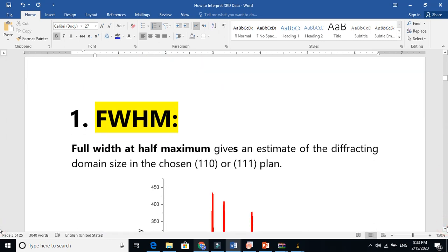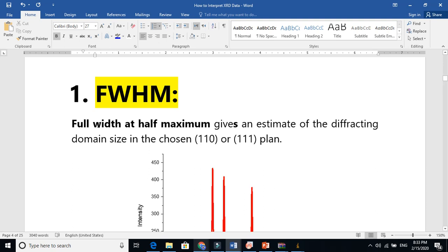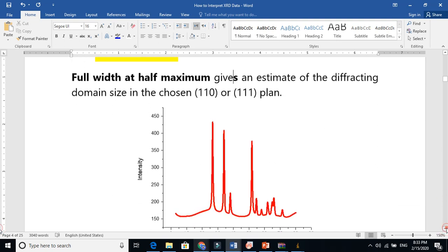Let's talk about the full width at half maxima. It basically gives the estimate of the diffracting domain size. Let's see what is full width at half maxima.